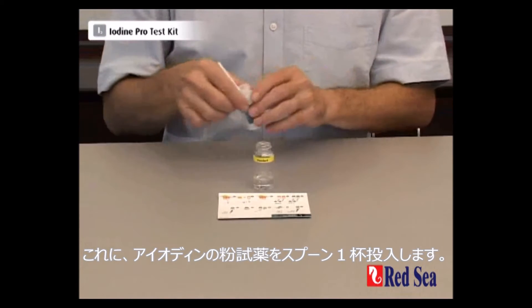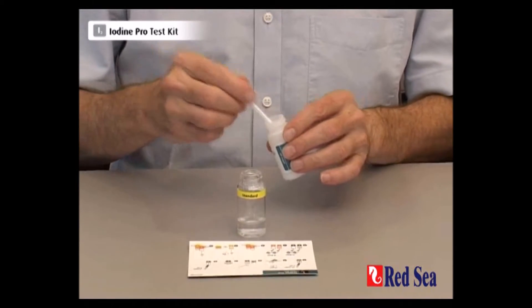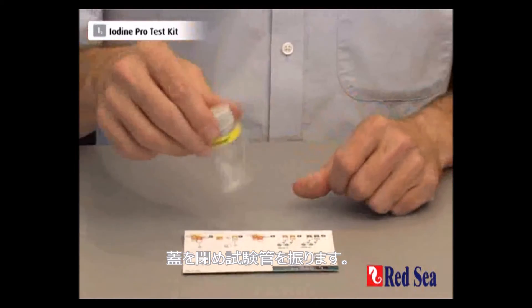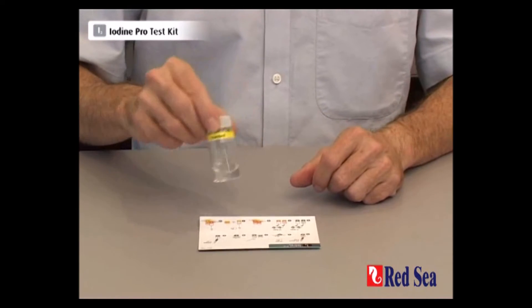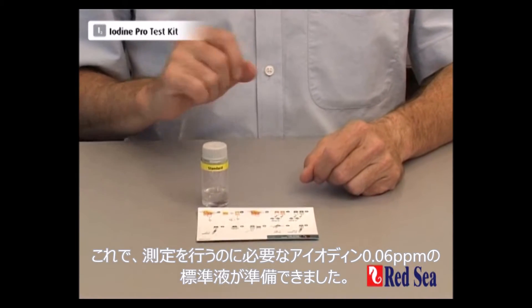We're now going to add one spoon of our iodine powder. Close the lid of the vial and shake. We now have a standard solution of iodine with 0.06 ppm ready to do the test.